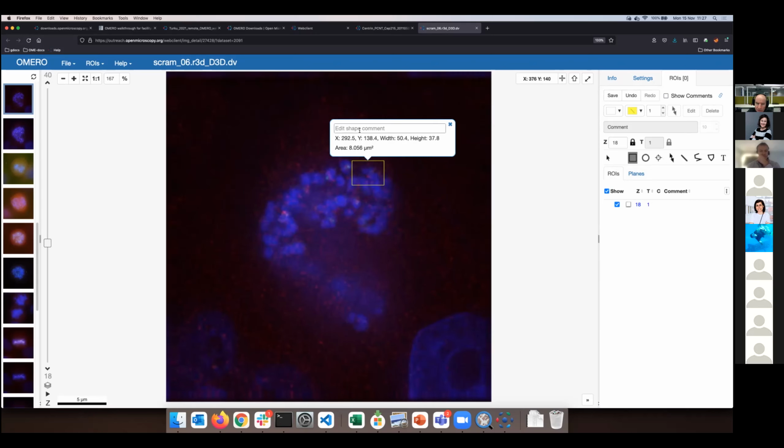Region of interest, you can see you can put a comment here, like new ROI, and it pops up immediately here on the image. You can draw regions of interest on your or somebody else's images as well. Now I can draw an arrow or line. I can do some very rudimentary analysis here already in this dialog.